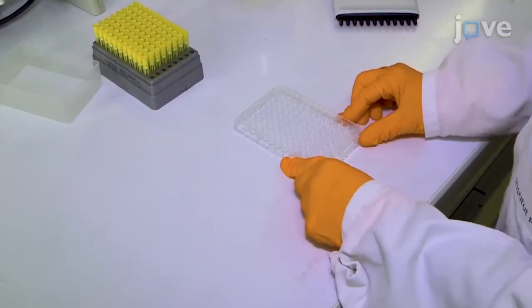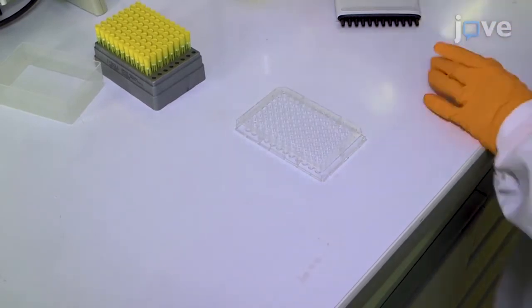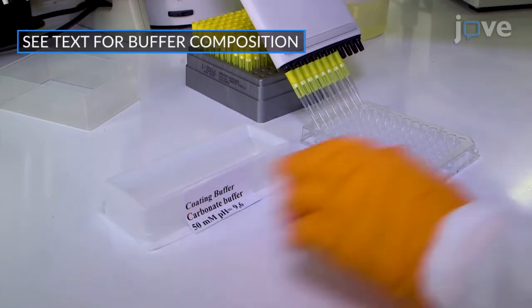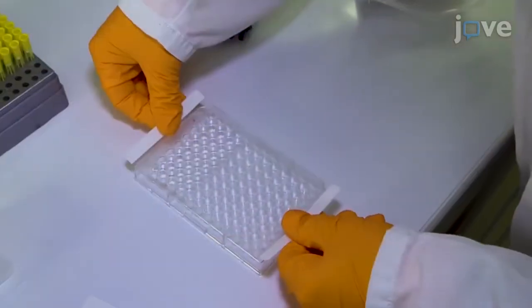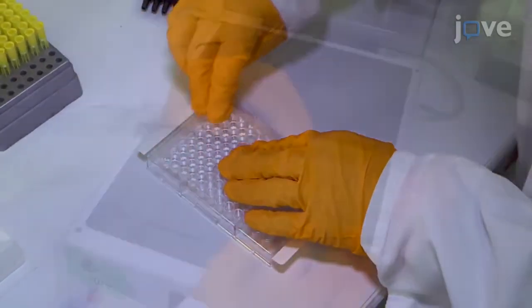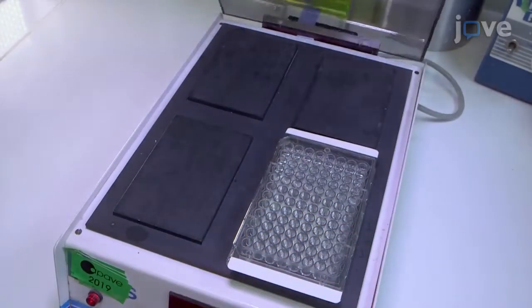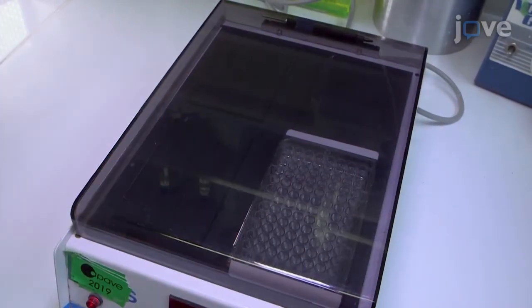Next, set out a 96-well immunoassay plate and add 200 microliters of the monoclonal antibody diluted in the carbonate buffer to each well. Cover the plate with adhesive film and incubate the microplate at 37 degrees Celsius for 3 hours in a humidified environment.